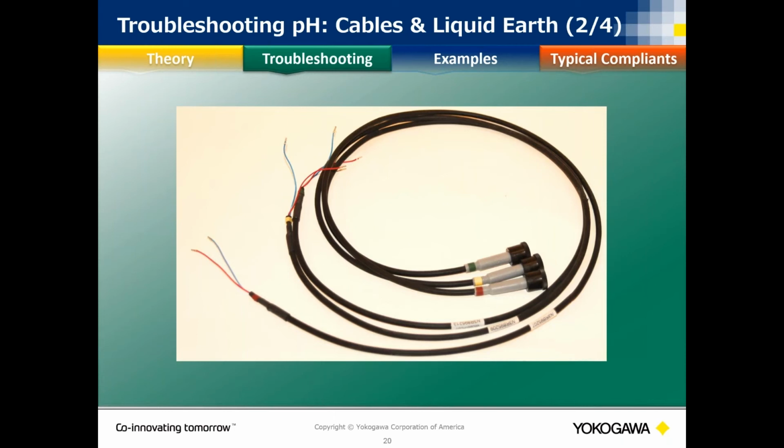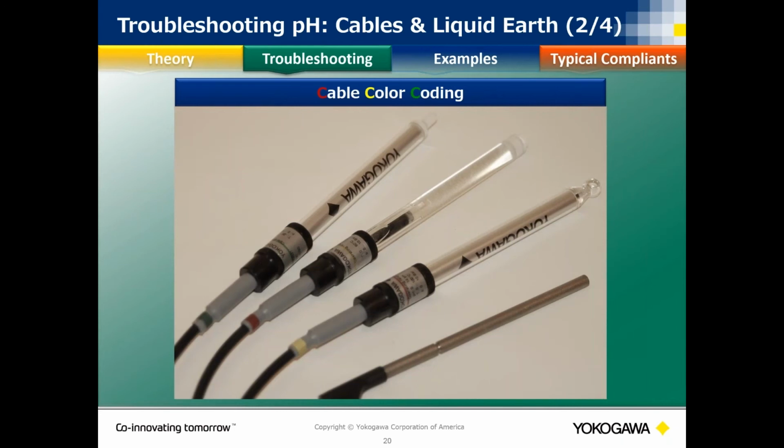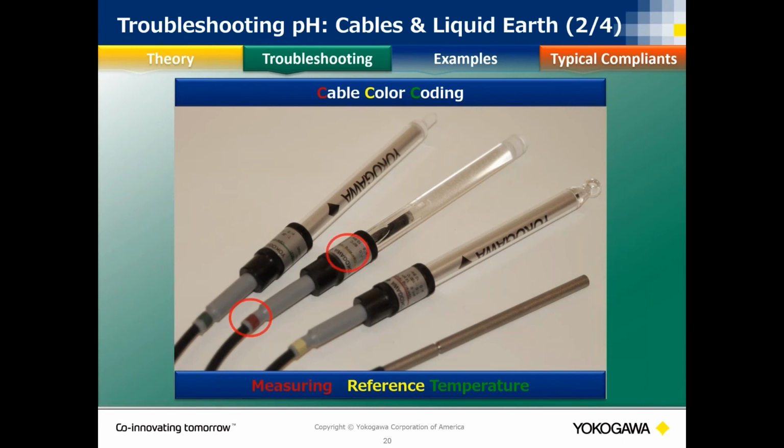This is where it kind of gets a little confusing. There's an example here of where you have those individual 12 millimeters that have individual 2-wire cables, and they mean certain colors. The purpose of that is when you have a sensor that's 10, 15 meters, so 30, 50 feet away, you know that when you connect this sensor to this cable, it goes all the way through your conduit and is terminated at the right terminals in your analyzer. Here's an example where this can be wrong.